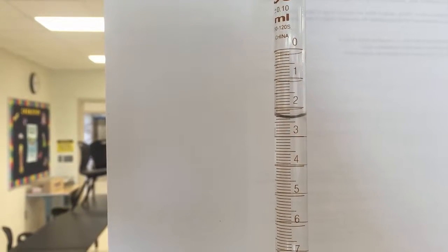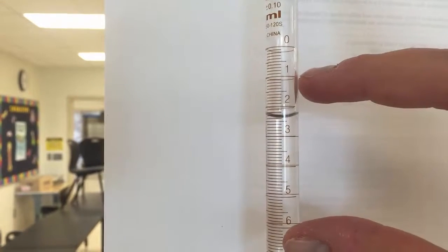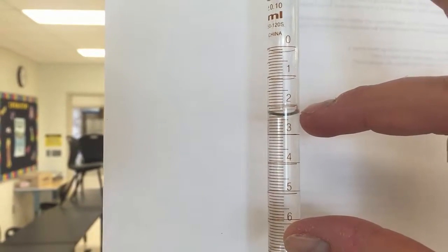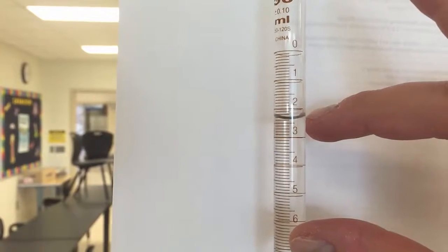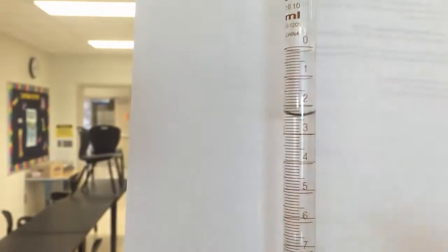When reading a burette, you have to read it from the bottom of the meniscus. If you look closely, this is saying, here's 0 to 1, here's 2, and we count down: 2.1, 2.2, 2.3, 2.4 milliliters. That is our starting point. So we start at 2.4, you're going to write that number down.